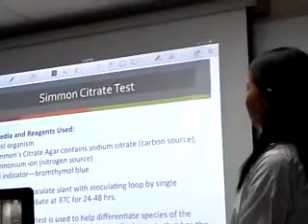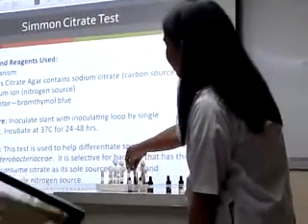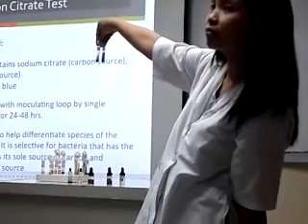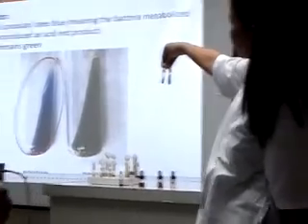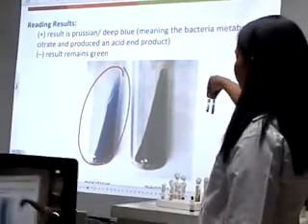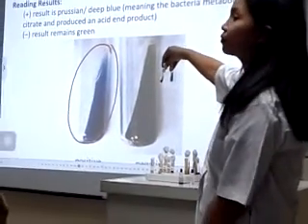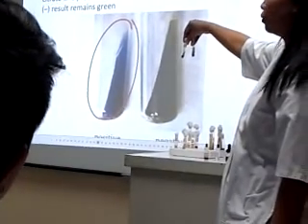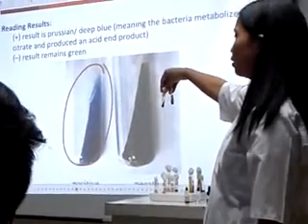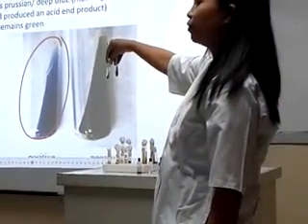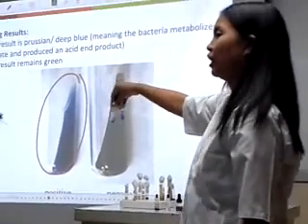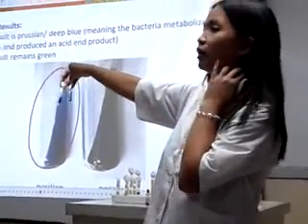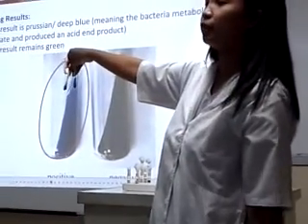For citrate: where is your citrate that you have inoculated? The positive color is deep blue or Prussian blue color. So the green color is negative — no change in color. And then you have your Prussian blue color for positive. E. coli is negative for citrate. Positive is Enterobacter — the blue one is Enterobacter, positive for citrate.